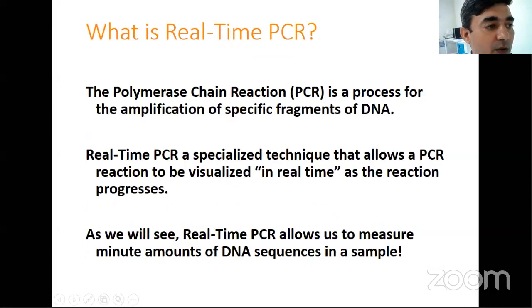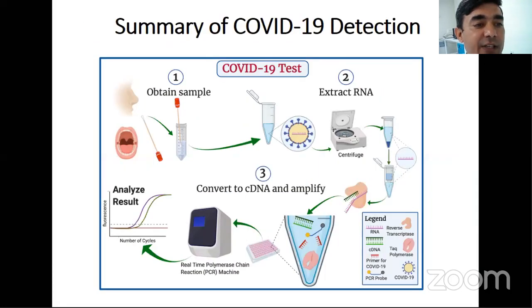So what is real-time PCR? I think Dr. Hannah earlier talked about the initial steps of real-time PCR. The name real-time comes from the fact that we can look at the sample behavior in real time. We can observe whatever is going on inside the PCR reaction and visualize it on the screen. So in real time we can observe the behavior of PCR reactions.